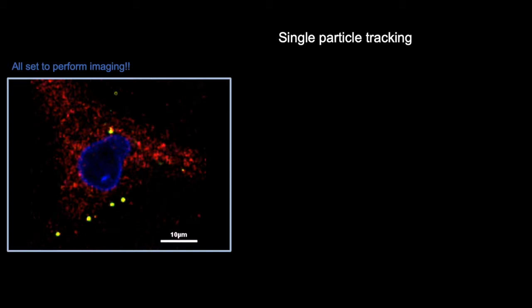Each spot has its own property, basically a fluorescence property. It'll appear like a peak. There's a PSF. So all these properties of spots go into algorithms of spot detection. Your single particle tracking involves 2 steps. One, you detect all the spots in your image, and then you start connecting the dots to see the trajectory of your viral particle as it goes inside cells. And there are, like I mentioned before, several software packages to do this. Today I will give you a primer, hands-on experience on this image analysis software to do single particle tracking.